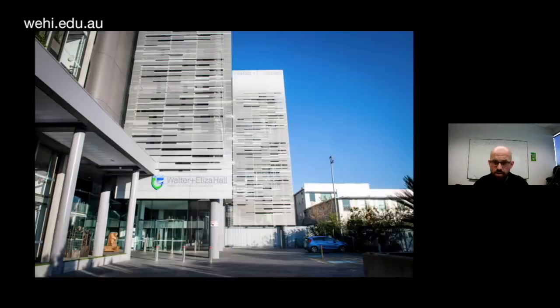But in 2015, on the other side of the world, here at the wonderful Walter and Eliza Hall Institute, Kelly Rogers and Lachlan Whitehead, otherwise known at the time as the Imaging Facility, were having a very similar epiphany to myself, and they recognized that this technology was just absolutely going to shake the game up in terms of live cell imaging. So they thought, how can we get our hands on it, bring it to the Institute, and then bring it to those who are going to get the most out of it, i.e. the biologists.